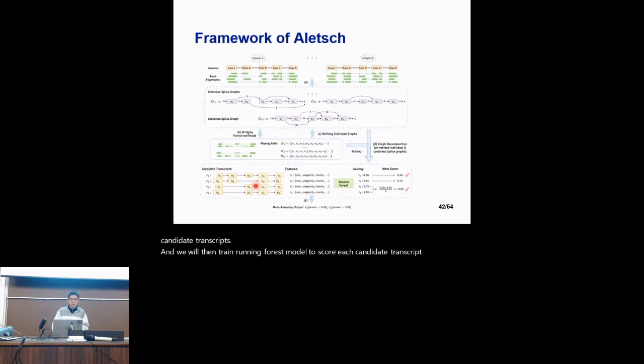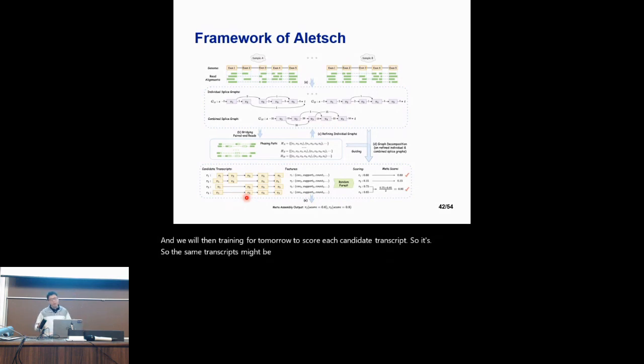So the same transcripts might be assembled from different graphs, and in that case, we will merge them into one, and their scores will be averaged.